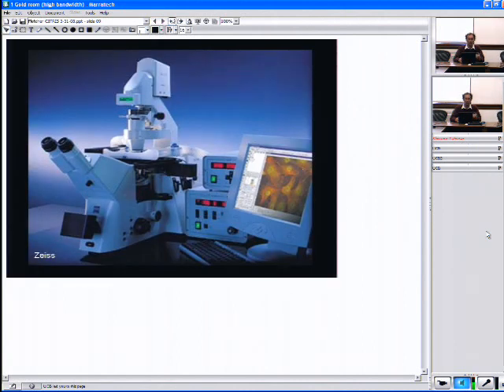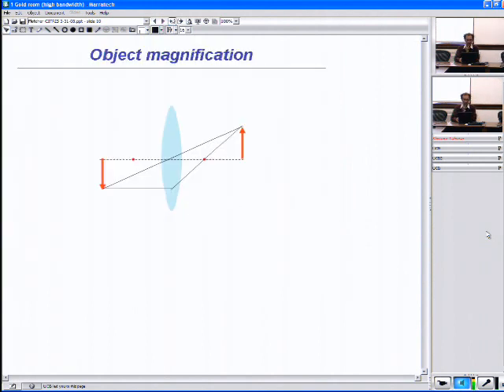So today we have this sort of system, and this sort of system allows you to use all sorts of contrast techniques, bright field, fluorescence, various phase contrast techniques, all of which are very helpful and relevant when you're trying to investigate a sample that's somewhat unknown or study a particular process in a single cell. But for many applications, this enormous capability may not be absolutely necessary. So let me review, for those who aren't experts in microscopy, roughly what microscopes do, and then talk a little bit about what we've tried to make a cell phone camera do.